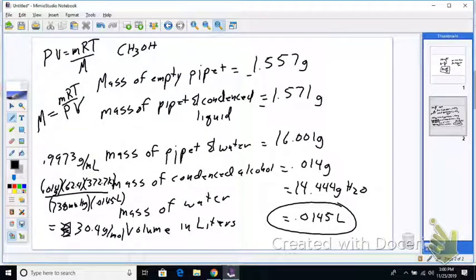Okay, so we're off by 2 grams. And if you wanted to find your percent error, you take 2 divided by 32 point, it's supposed to be 32.04, right? That's what this is. Actually 32.05 is what it is. That's what I was reading.